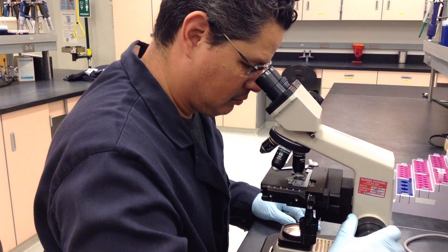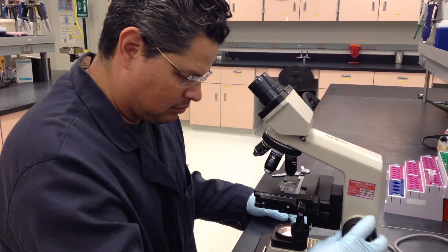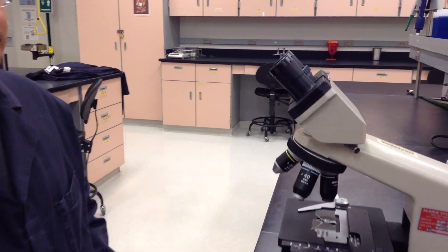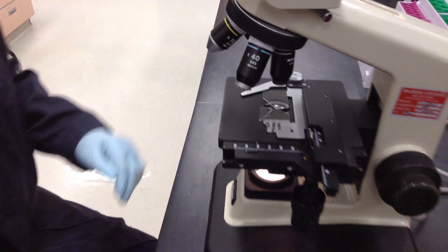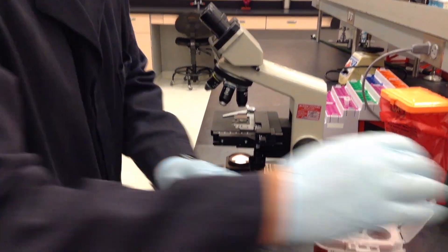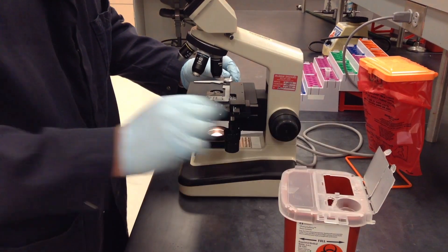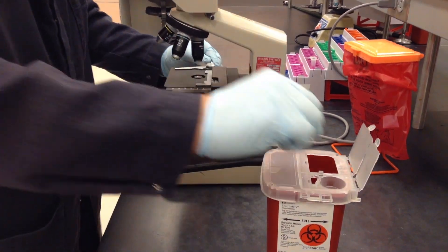Later in the course, you may encounter the situation where you cannot focus on a slide. You may find that the glass slide has broken. If this is the case, carefully move the objective lens out of the way and carefully remove the pieces of the broken glass. You may discard the broken glass slide in the small red sharps container bins located on your bench top.